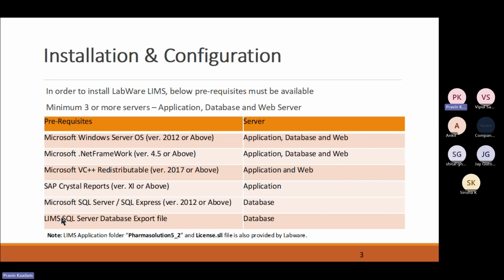And then finally, LabWare should provide you with the database. They provide the database in the form of an export file, which is usually a backup file. Once all these prerequisites are ready, you can start with the installation process.